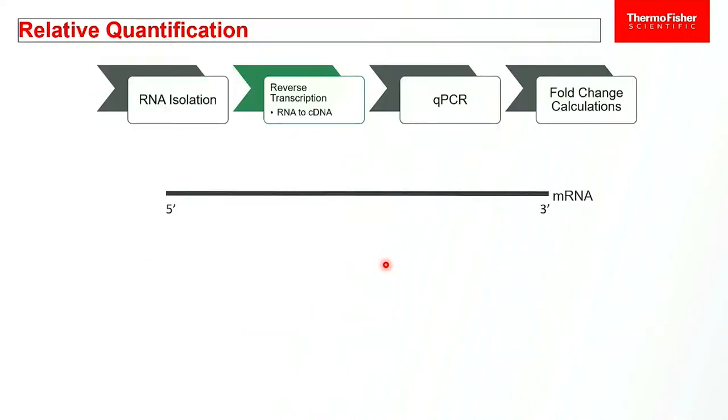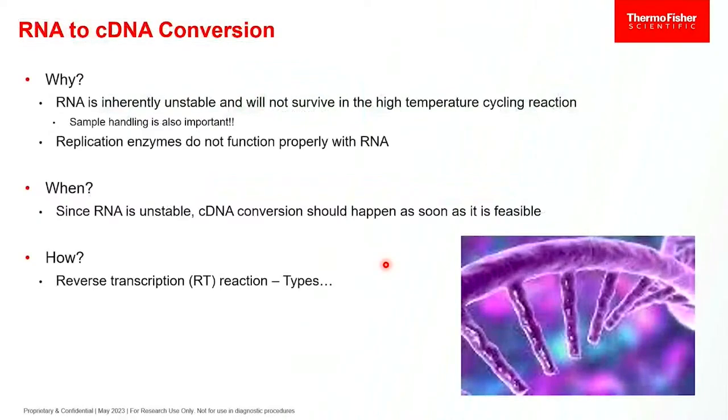I've sort of outlined a general experiment. So when we do gene expression, first we need to collect our RNA sample. Okay, we collect that, and then we have to do reverse transcription. We had a question about what is reverse transcription. So let's get into it. The enzymes we use to do the copying don't work on RNA very well. Okay, that's point number 1.